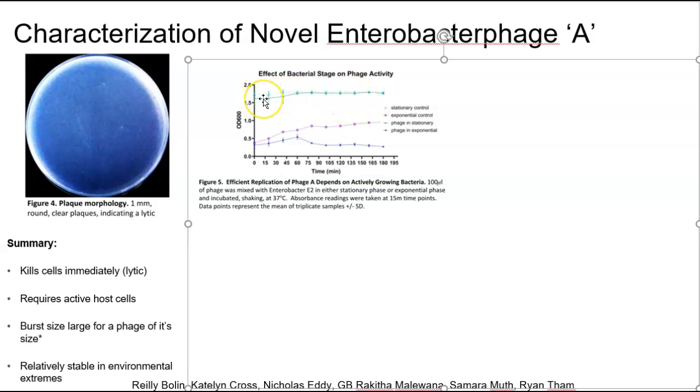There's lots of bacteria in the tube, so that light is getting bounced around a lot. So the absorbance is pretty high. The bacteria are absorbing the light. You're not getting good transmission. The transmission is low, the absorbance is high. And these lines almost overlay, you're not really seeing a big difference here. So the phage is not doing a good job of killing these bacteria.